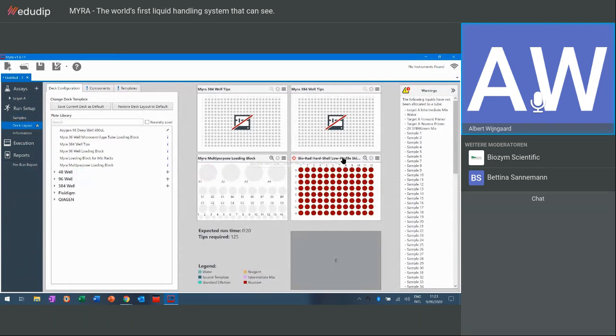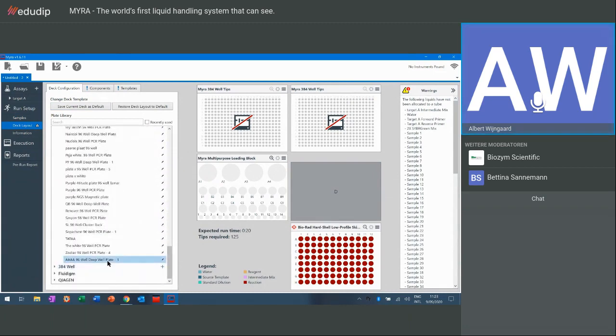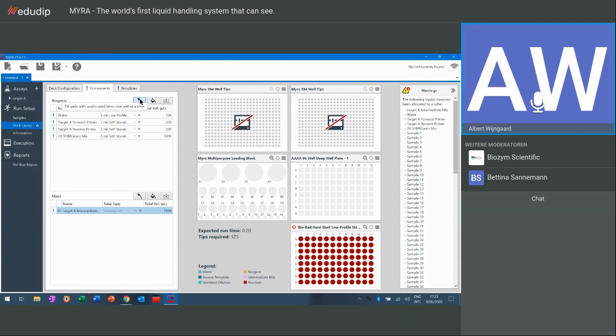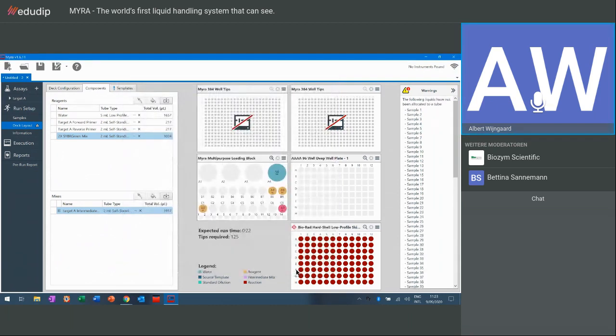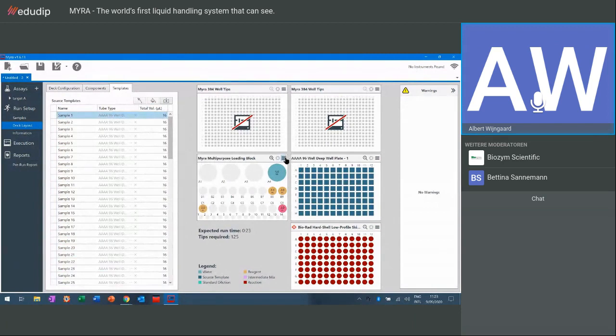The deck layout. So this is our 96 well plate. We're going to use the plate we made previously. And we're going to add our components. So here's your water, forward, reverse primer, 2x SYBR Green, and this is our master mix. That needs to be in a 2 ml tube. We're going to add the templates. Really easy. And this whole exercise just takes 23 minutes. So it takes 23 minutes to fill up a complete 96 well plate.